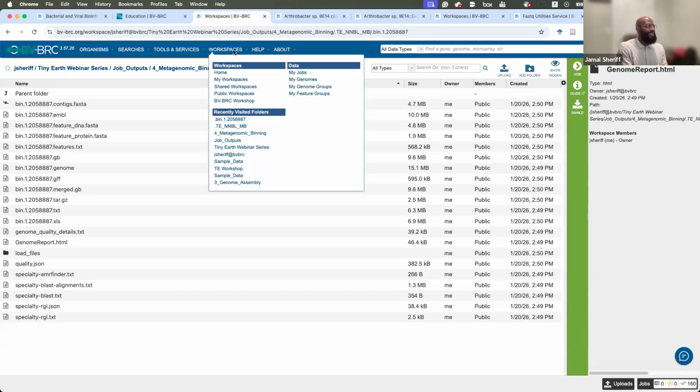We'll see next week when we do comprehensive genome analysis that we can use the genus that contained the majority of our reads as our target genome. So we identified relative abundance of taxa, looked at our plots, then assembled contigs from our FASTQ files, and built our metagenomic bin.